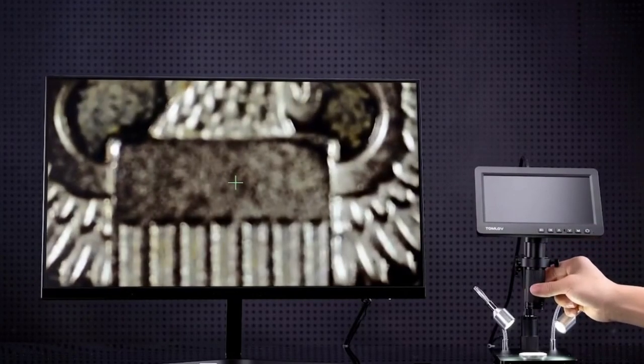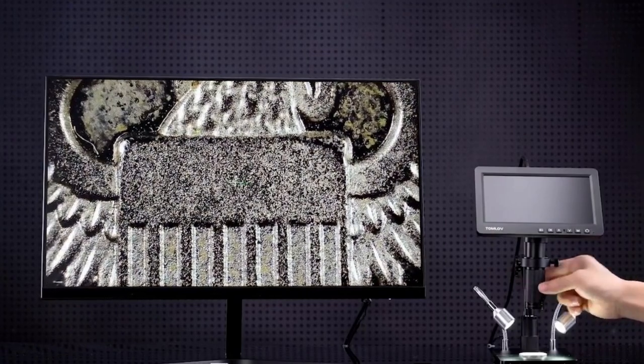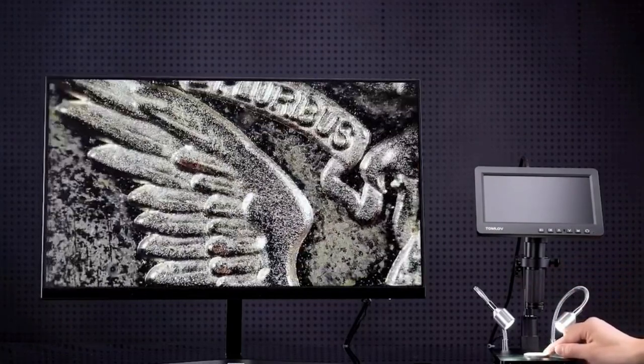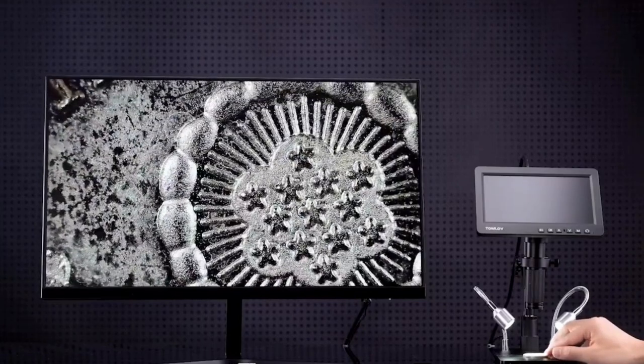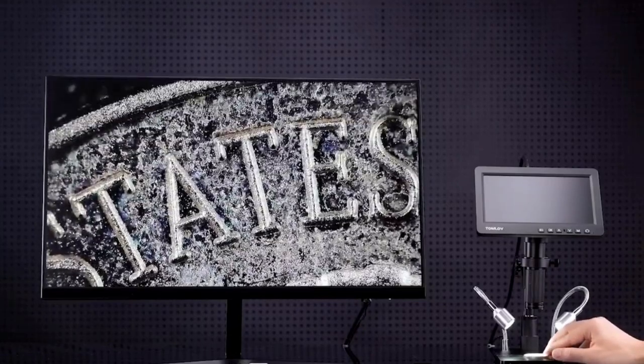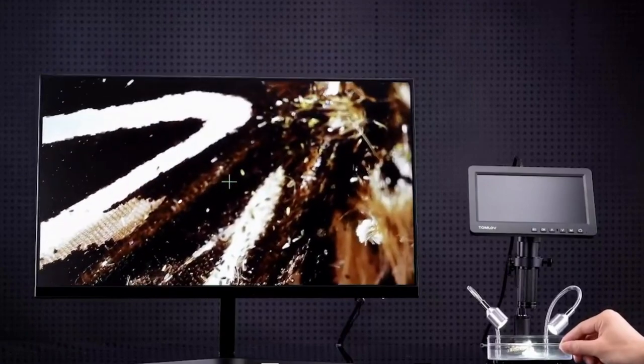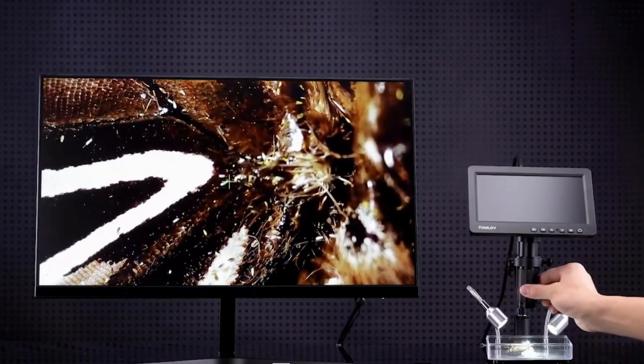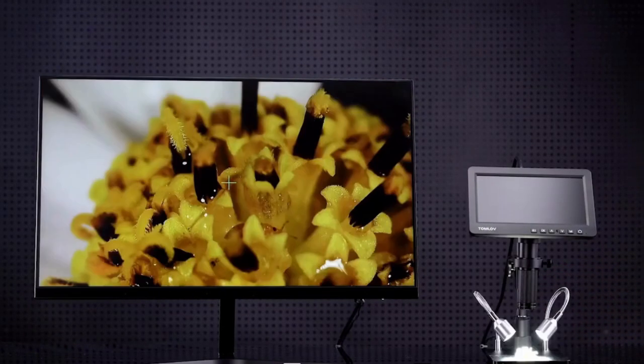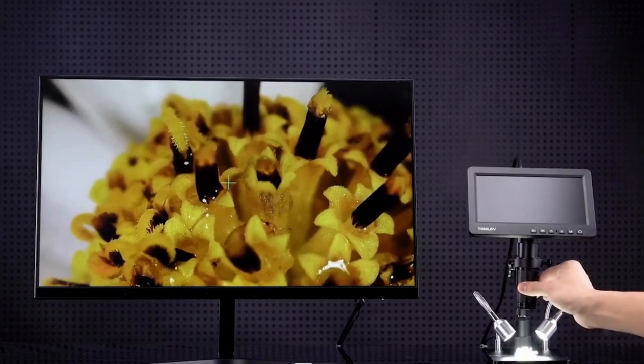Operating the DM209 is a breeze. A simple rotation of the metal knob allows you to zoom in and focus effortlessly. Capture the invisible with stunning 1080p/30fps videos and 26MP photos. All your precious data can be stored on the included 32GB SD card for further analysis and sharing.